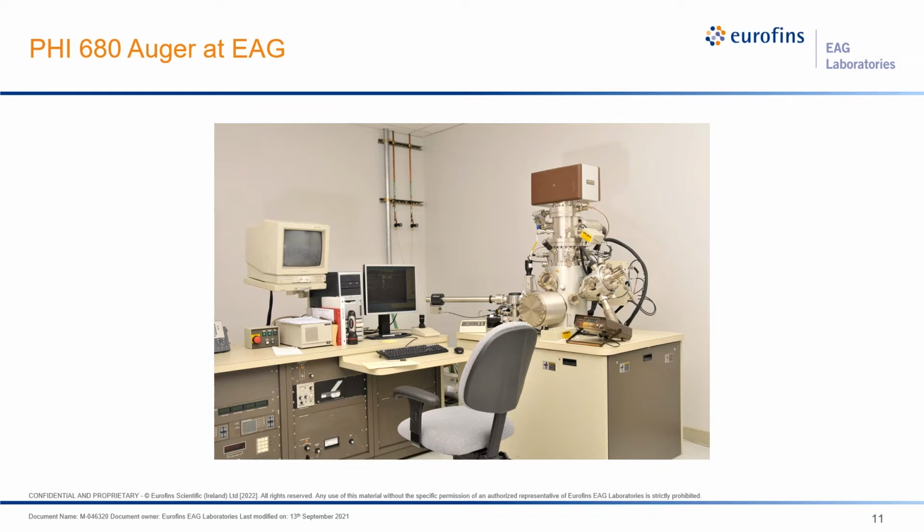Below that, you can see a couple of cylinders that house the electron gun and the CMA. There's a viewing port here to make sure you haven't dropped the sample after transferring it from the small intro chamber here into the main chamber with the use of this long transfer rod, which is coupled to this black handle with rare earth magnets. The large cylinder jutting out towards us contains the stepper motors and drive hardware to move the sample stage in 5 different directions. And then here is our argon ion gun with a thermally controlled leak valve.